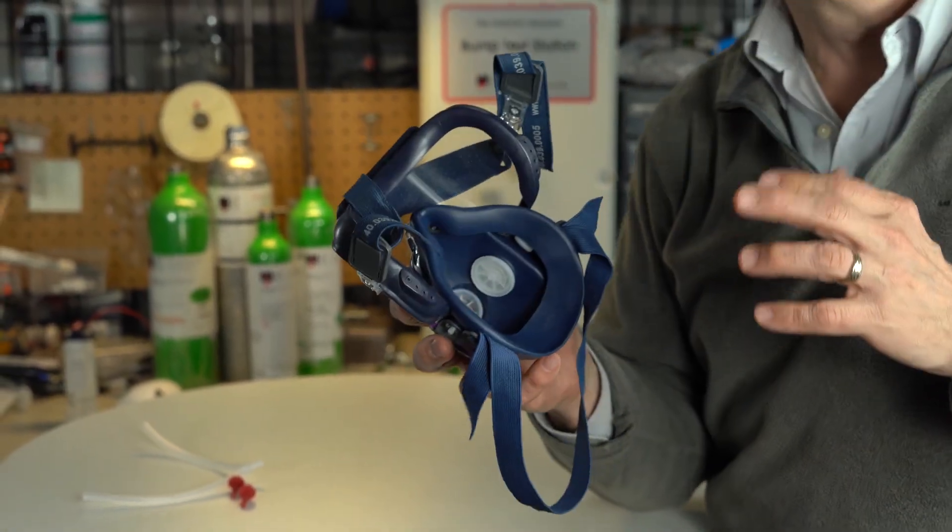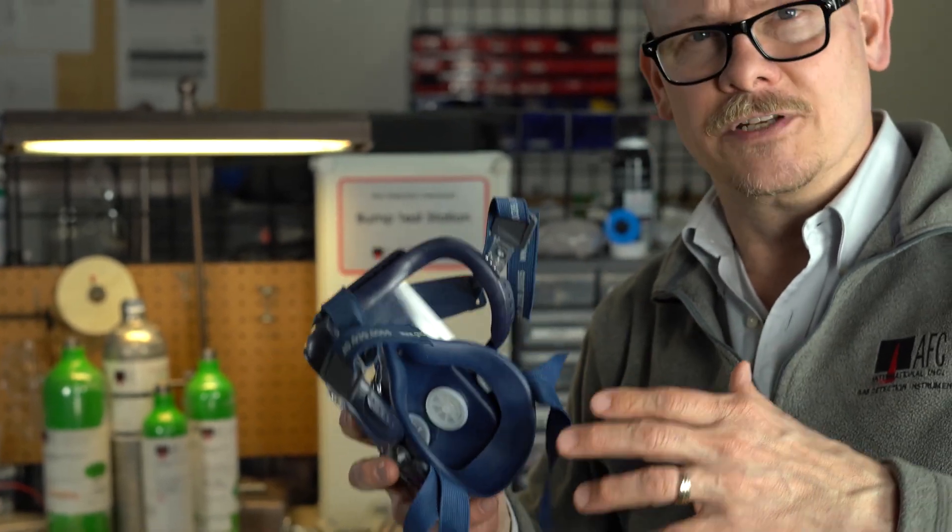Now with the pandemic and everything, it's really difficult to get everybody fit tested, but do the best you can. Once things slow down a little bit, maybe you've been issued some masks and haven't had a proper fit test — maybe you start to think you should go ahead and do a fit test. That's the importance of it.